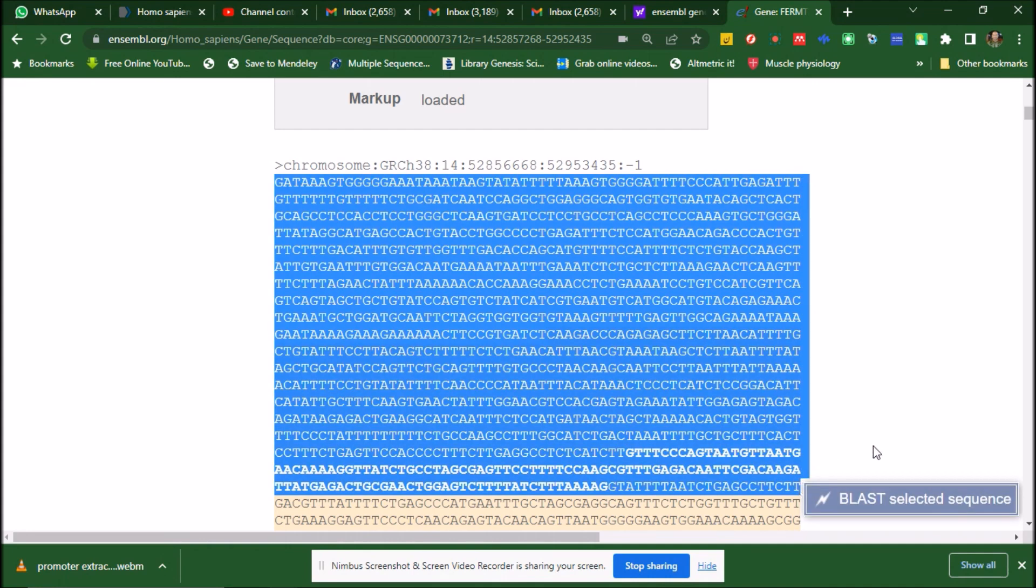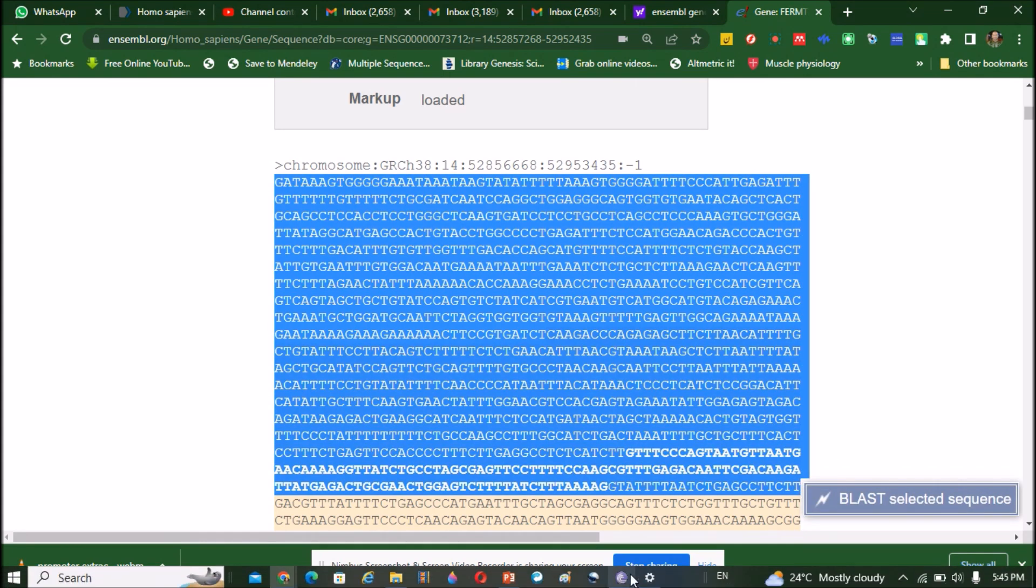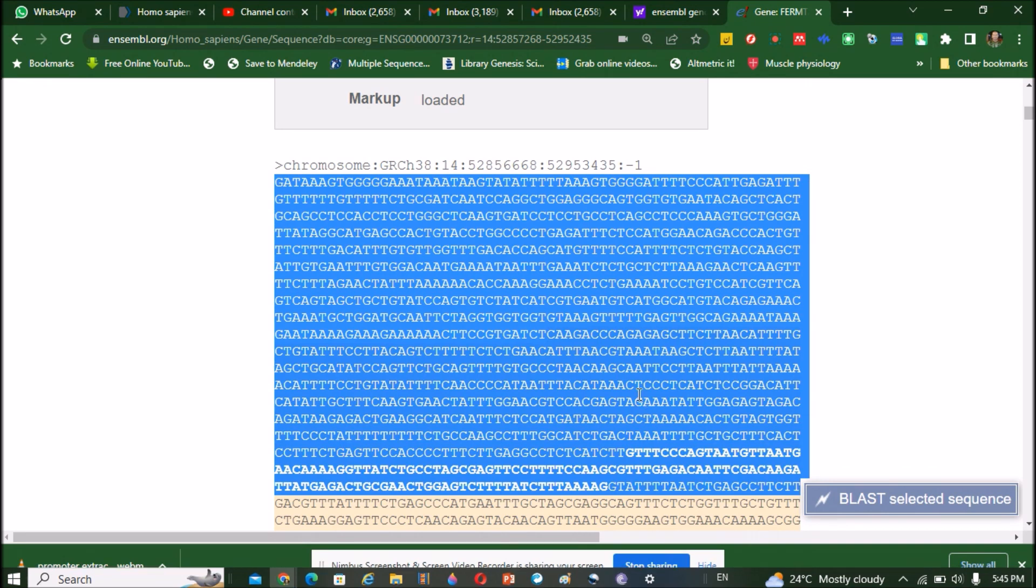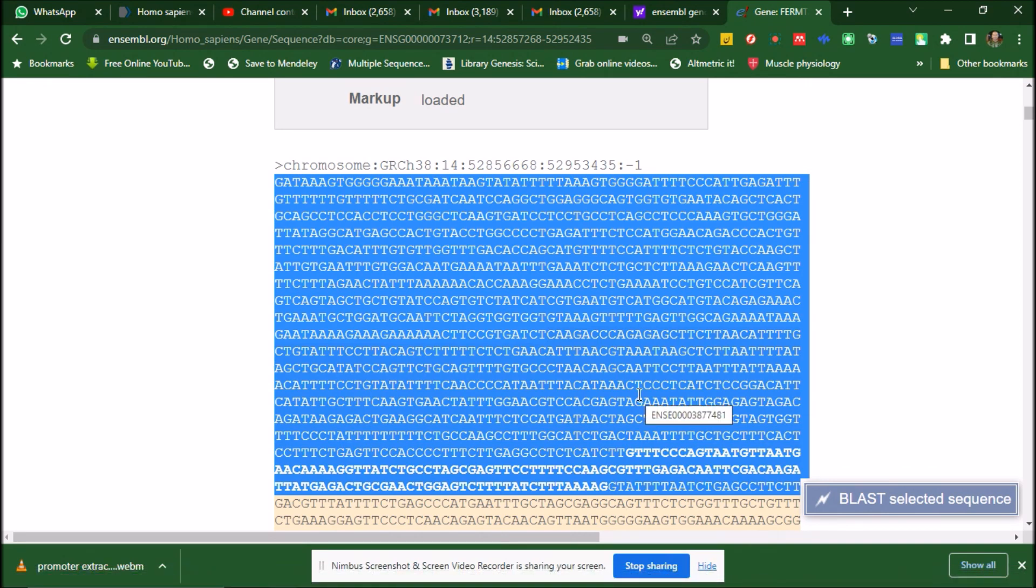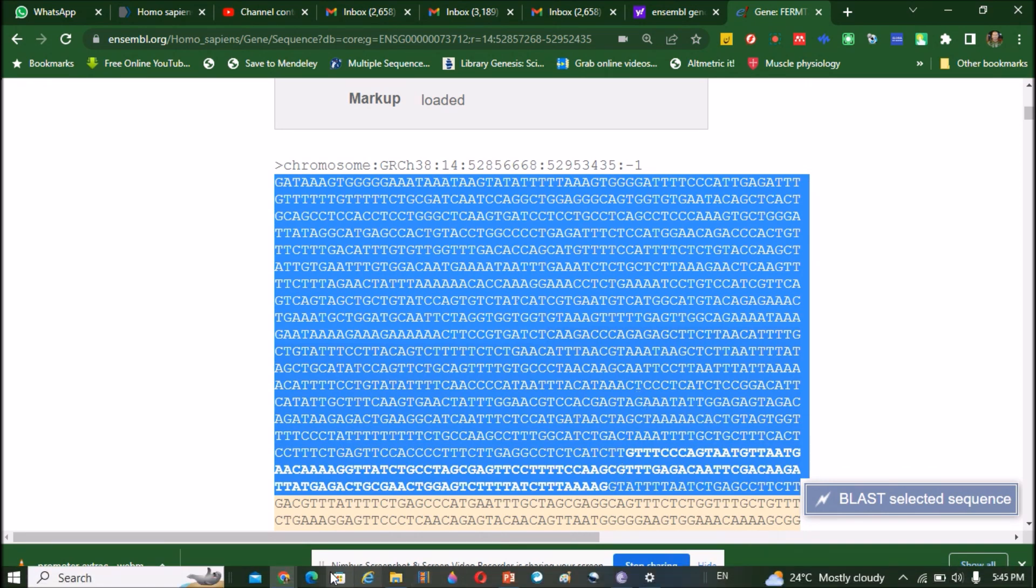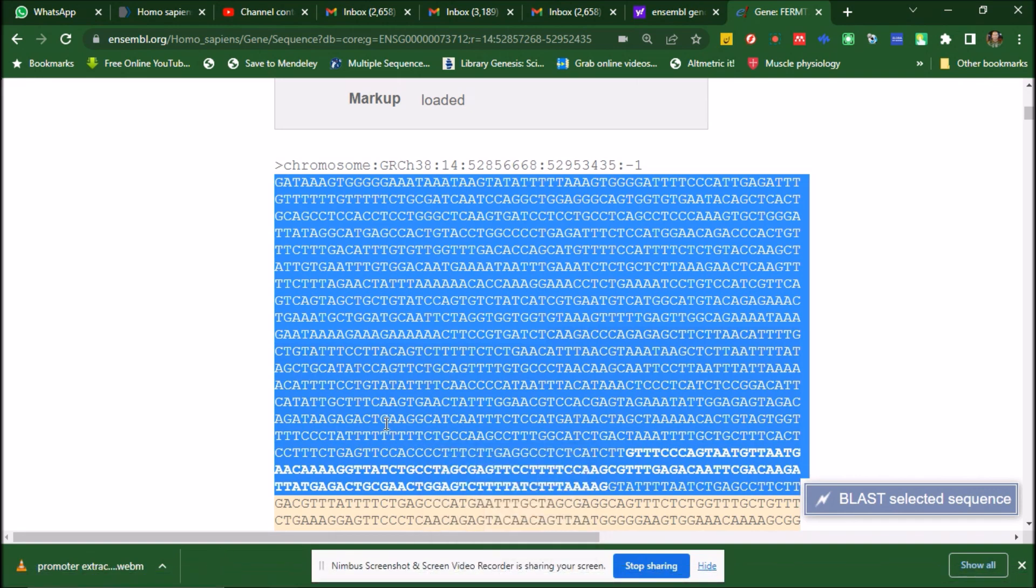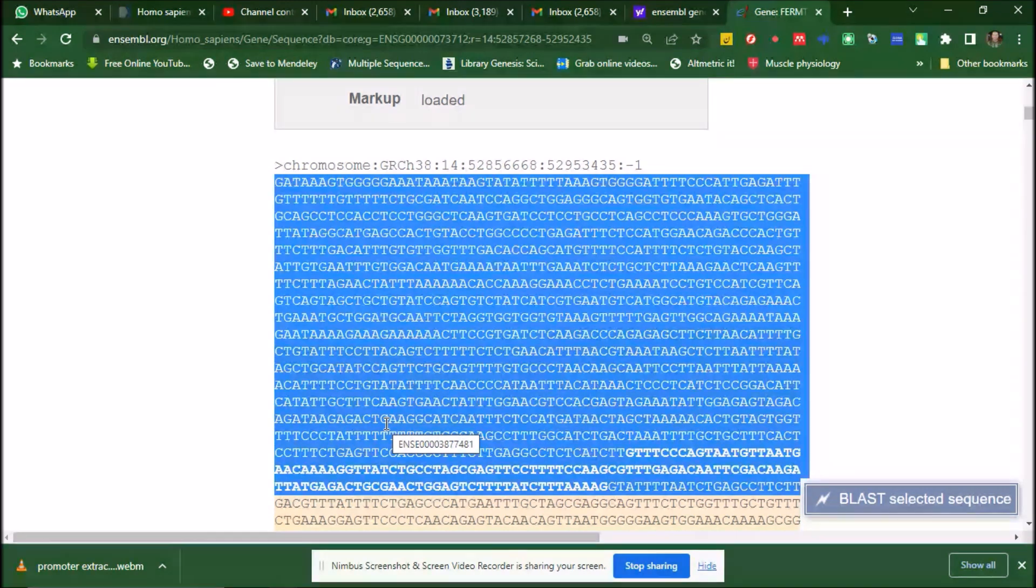So next we copy it and we paste it on the word and that will be 1200 base pair promoter sequence. In this way, you will extract the promoter sequence of a single gene or of a gene of interest by using Ensembl. Thank you very much.